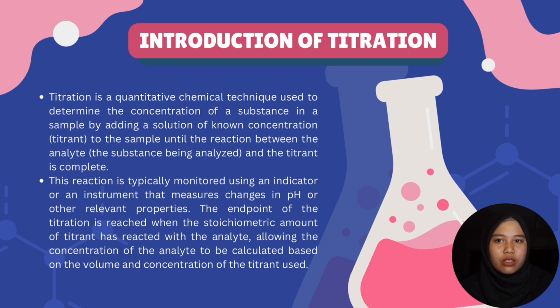The endpoint of the titration is reached when the stoichiometric amount of titrant has reacted with the analyte, allowing the concentration of the analyte to be calculated based on the volume and concentration of the titrant used.